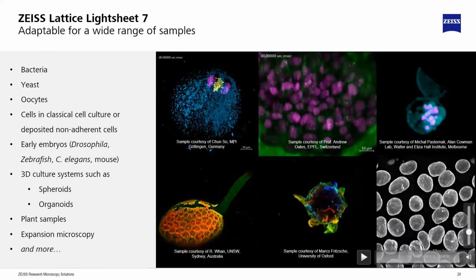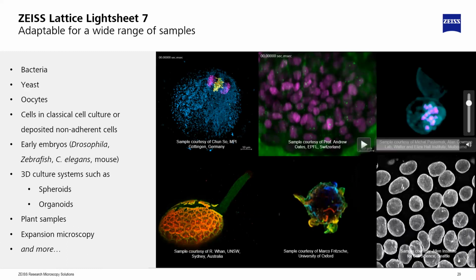The spatial resolution of this system is going to be comparable to a confocal. It's around 300 nanometers in X, Y, and Z. So that's where the advantage really comes in, is with that Z resolution versus a system where you're imaging through and then detecting through the same objective. We get the isotropic resolution on this system.